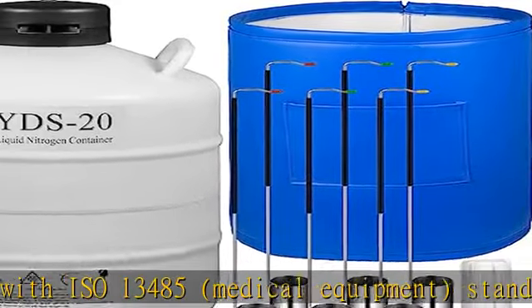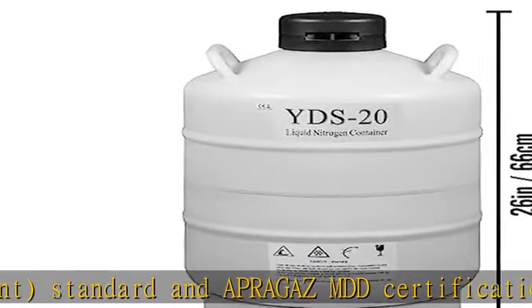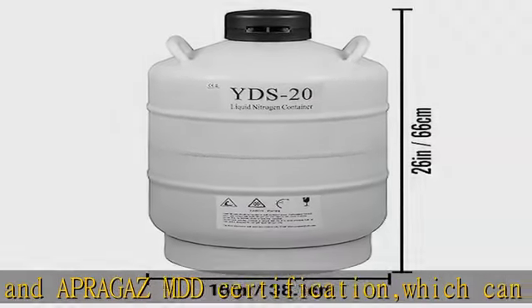Insulation and vacuum design: multiple insulation layers surround the tank, and a gas adsorbent design ensures great vacuum storage inside, allowing samples to be stored for a longer time.